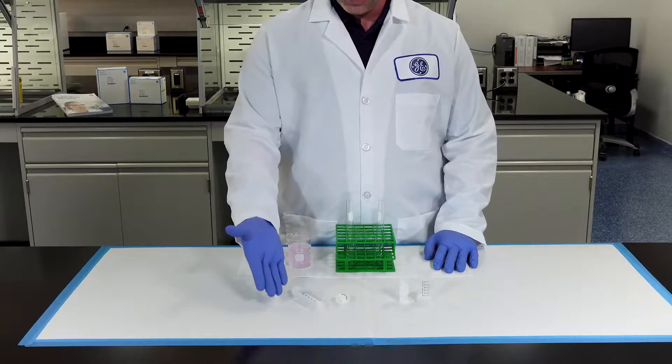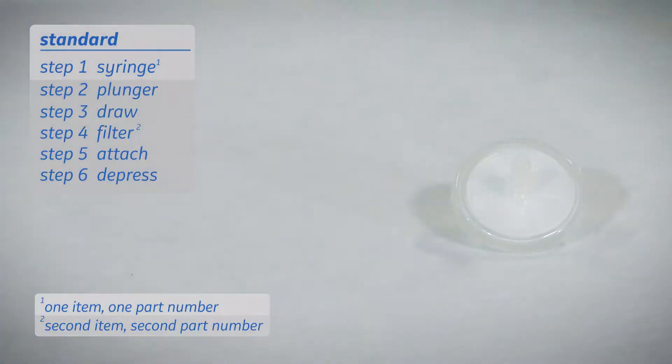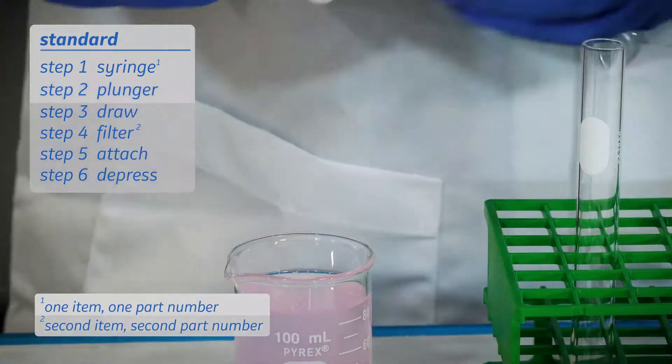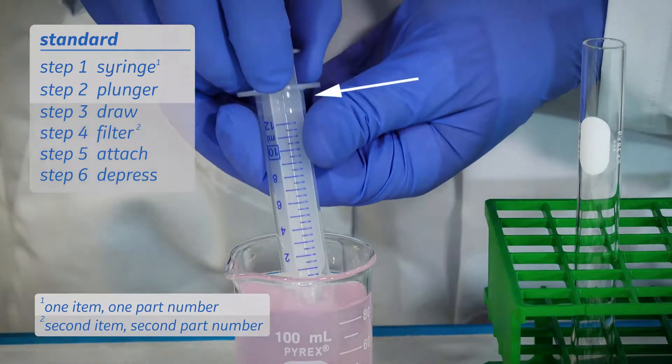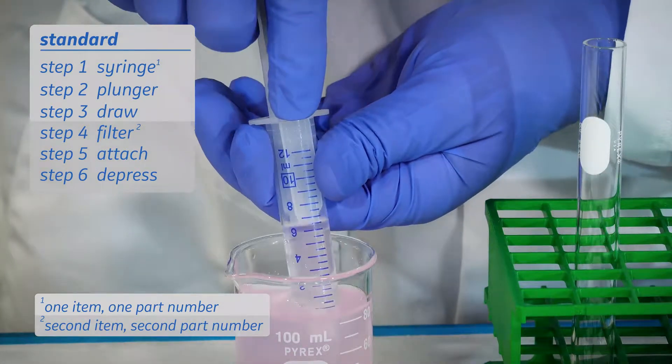First, let's look at the standard syringe and syringe filter. Retrieve your standard syringe. Begin with the plunger inside the syringe barrel. Draw the liquid to be filtered into the syringe barrel.